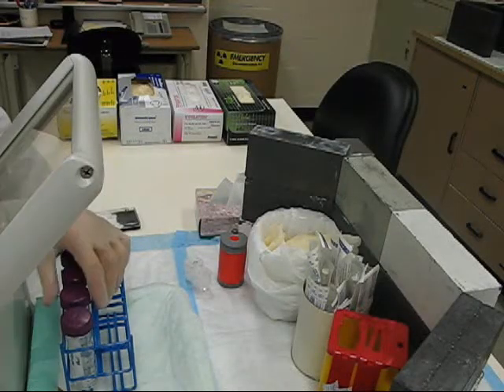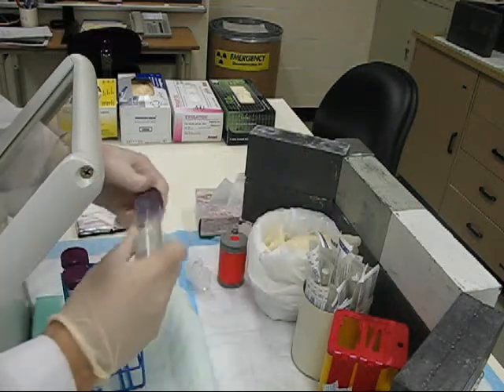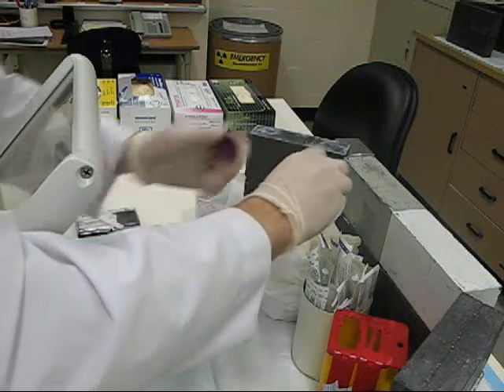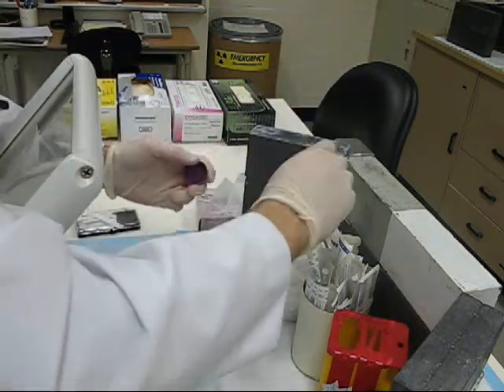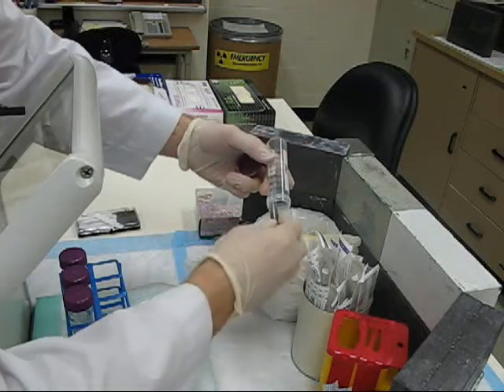Once your counting is complete, be sure to empty your containers. Sometimes it gets a bit sticky, so use your tongs to pull it out.